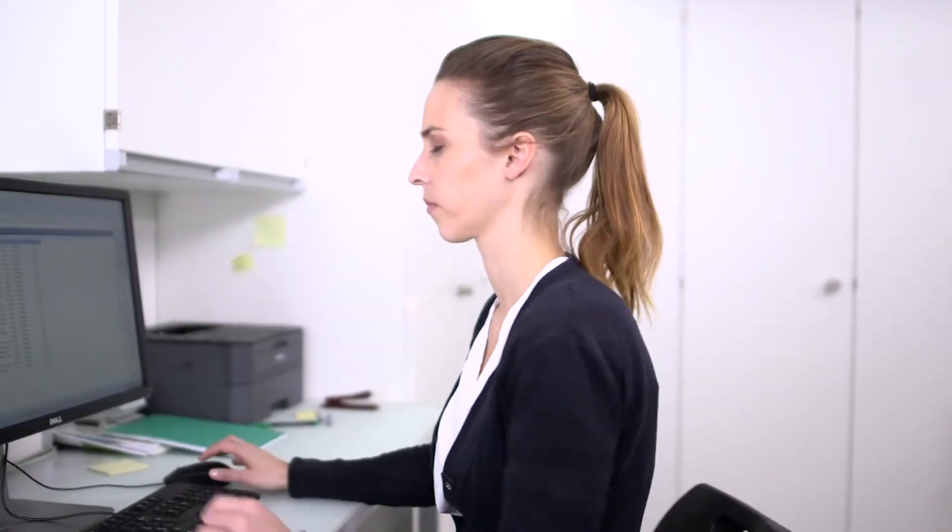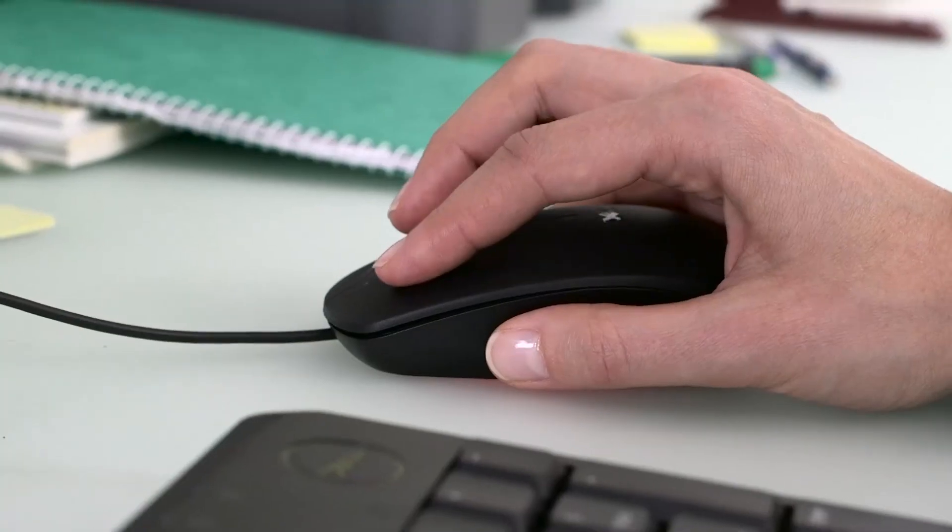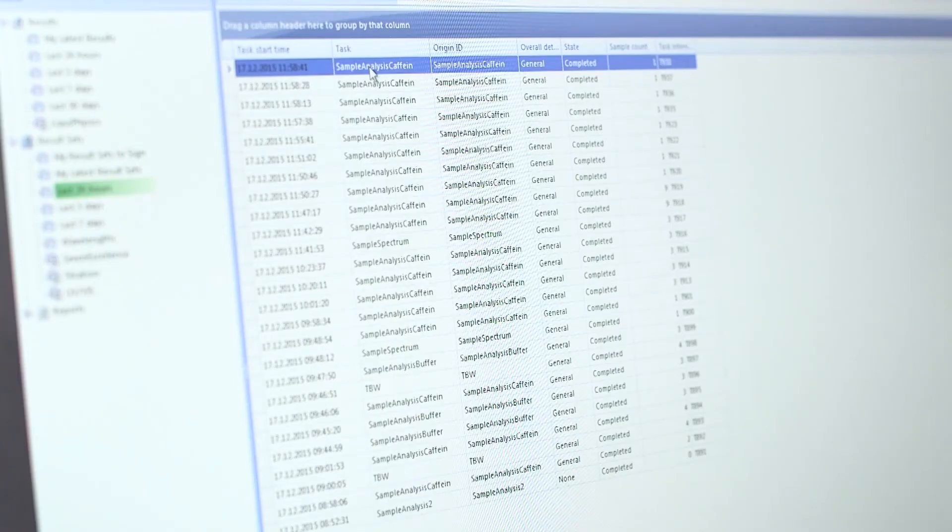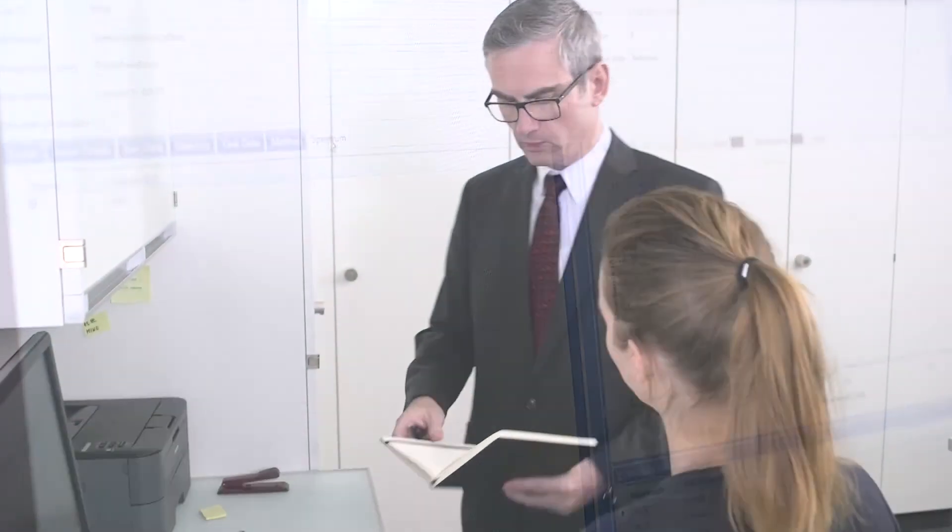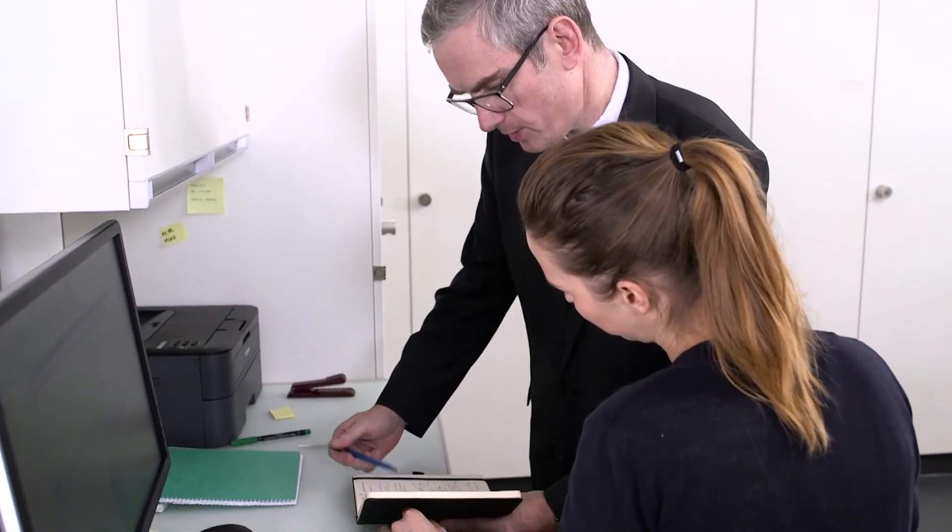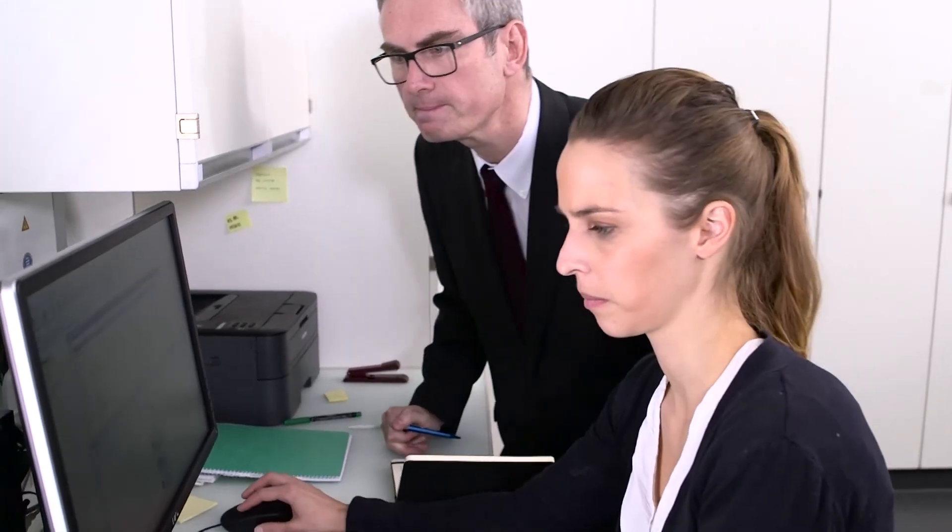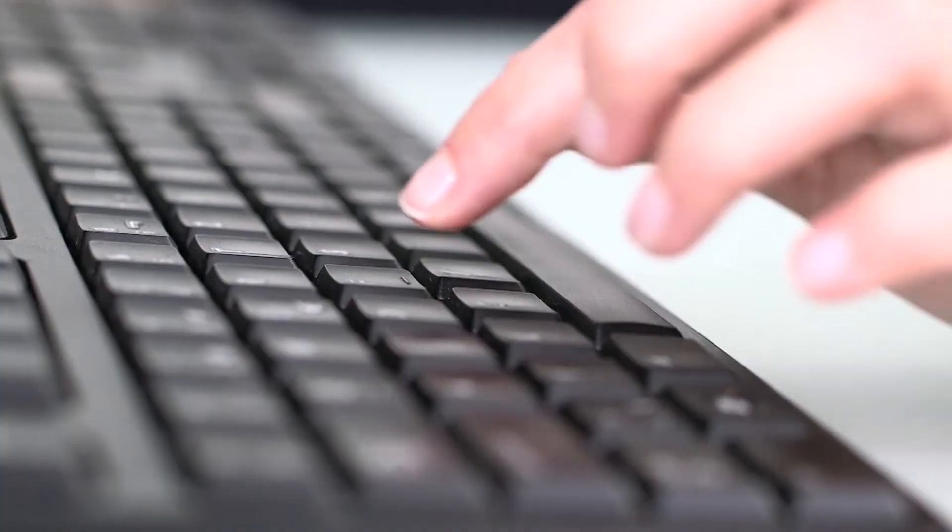All data is automatically available on any connected PC. With auditors focused on the raw data and metadata, the electronic records are the primary interest. With powerful search capability, data can be easily retrieved from the secure database.